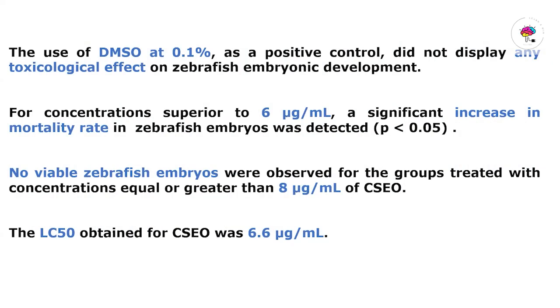did not display any toxicological effect on zebrafish embryonic development. For the concentration superior to 6 microgram, a significant increase in mortality rate in zebrafish embryo was detected. We note also that no viable zebrafish embryo were observed with concentration equal or greater than 8 microgram. The lethal concentration for 50% of the embryo was 6.6 microgram.